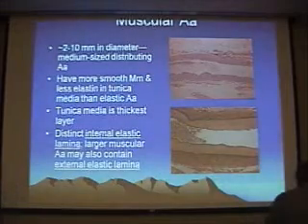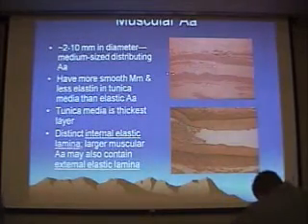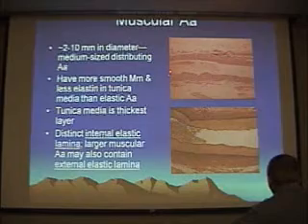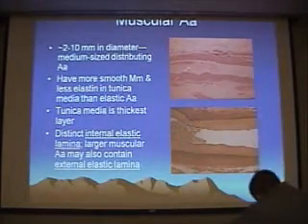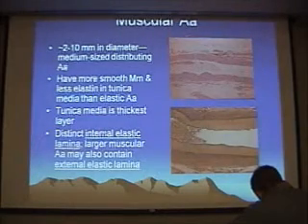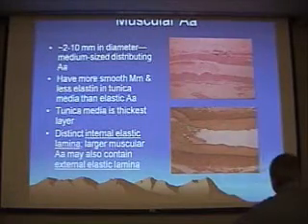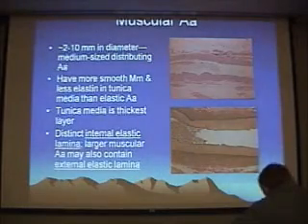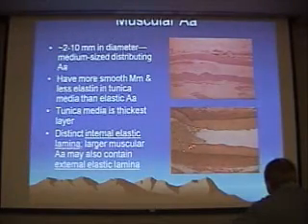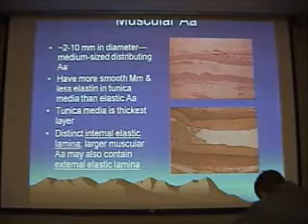Here we have a nice slice through a muscular artery in both an H&E and a special stain. In this magnification, it's very difficult to make out the tunica intima and that internal elastic lamina right below it. The media shows up very nicely with smooth muscle, and then we have the tunica adventitia, which kind of blends in with the surrounding adipose tissue. In the special stain, the internal elastic lamina is stained very darkly, followed by muscular tunica media, the external elastic lamina, and outer tunica adventitia — a very nice example of a muscular artery.